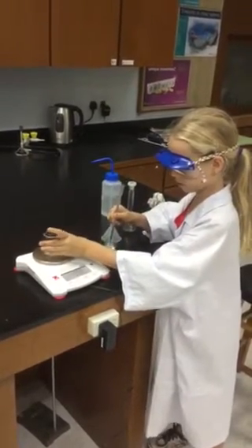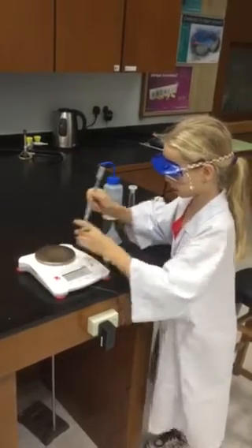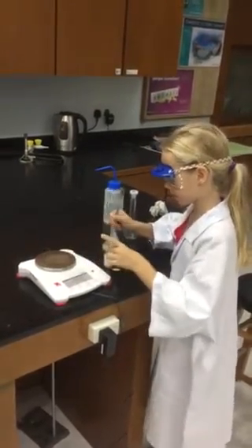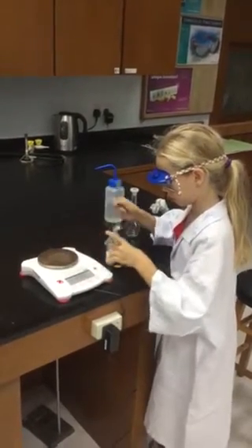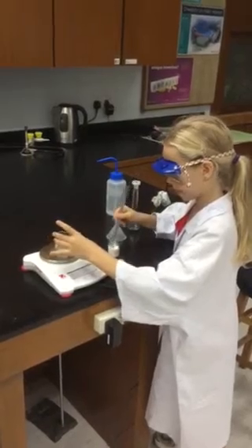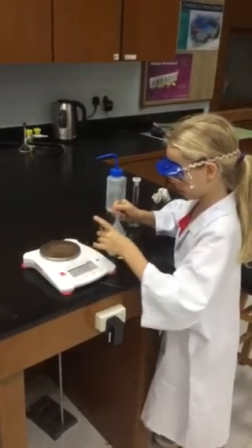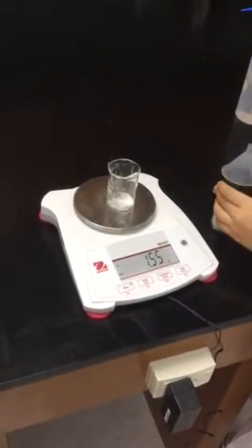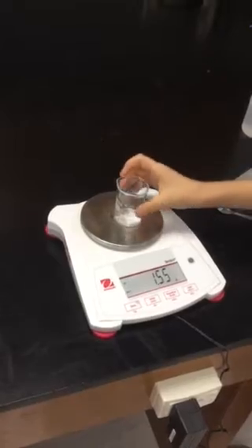I think we need about twice as much as what's in there already. Maybe a little. Okay. No, we want 1.55 grams. Ooh, tiny bit more, please. Whoa, look at that. 1.55 grams.